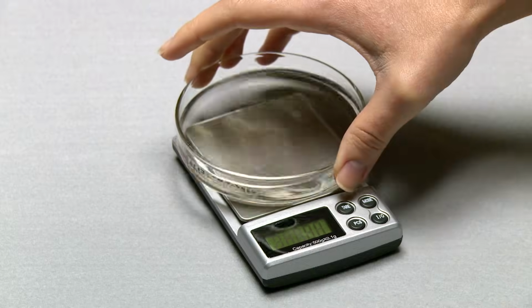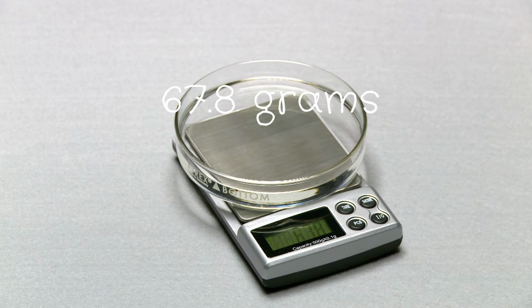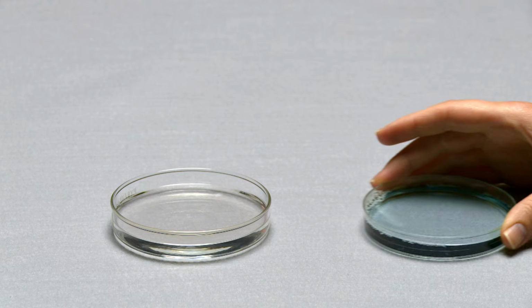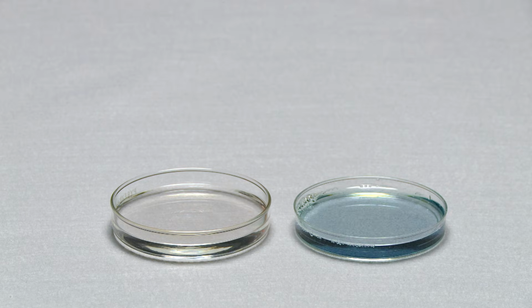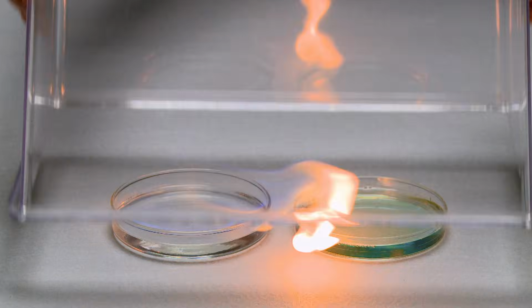And we're back. Now let's investigate. First, we add ethanol to the petri dish and put it on the digital scale. We're starting with 67.8 grams of ethanol. Then we fill a petri dish with fresh, new, blue BTB right next to the ethanol. Now, we ignite the ethanol with the lighter and then cover both petri dishes.